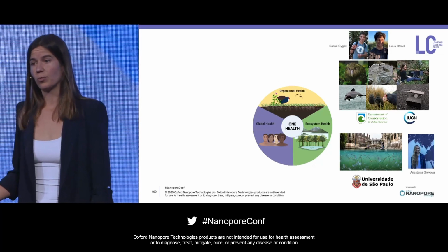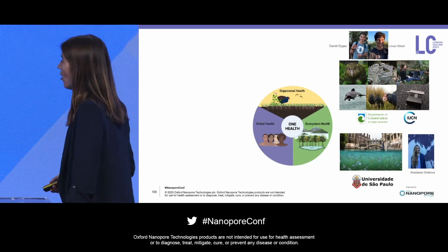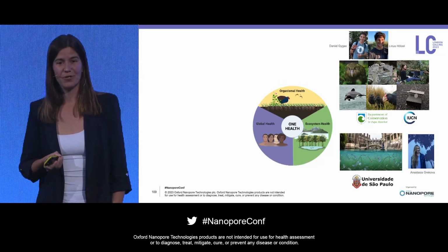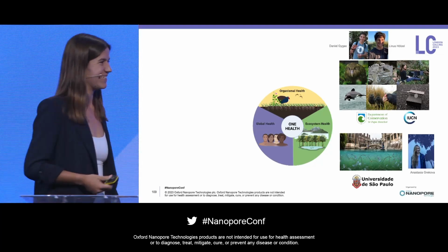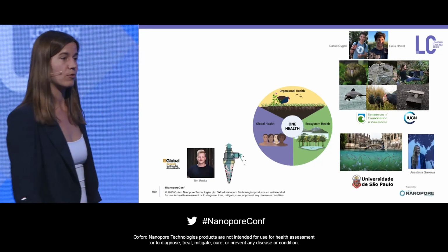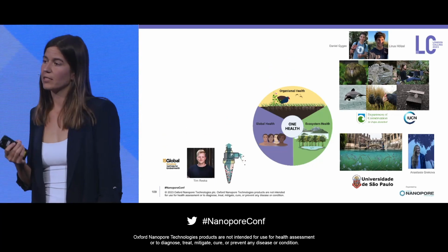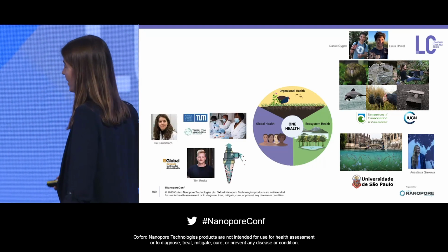We further use nanopore sequencing for ecosystem monitoring, such as assessing the quality of fresh water. And here we have started a big collaboration with Brazilian partners whom I met for the very first time at London Calling last year. So go out there and socialize, I guess, is the message of this. We also expand the ecosystem monitoring to assess the air microbiome or air quality, where we are using cyclonic technology to sample and then sequence air at a high rate.